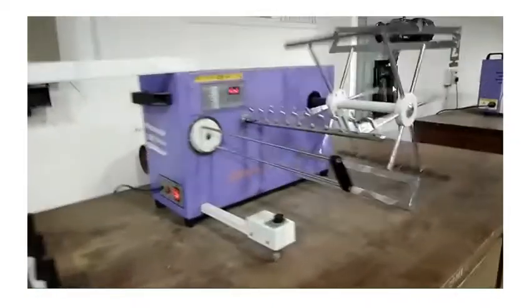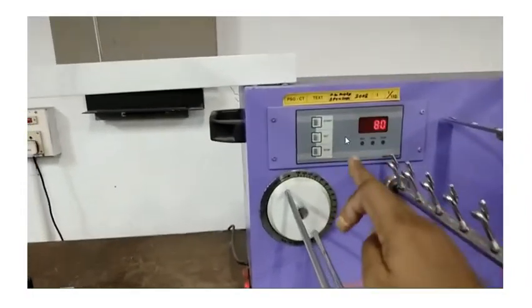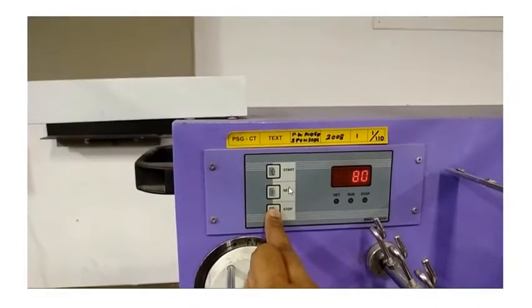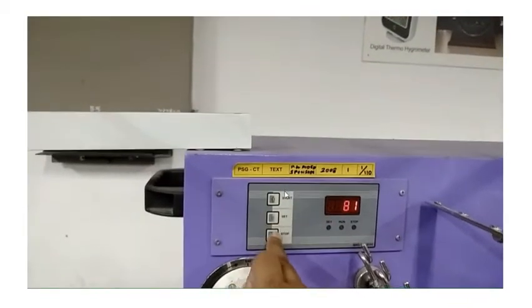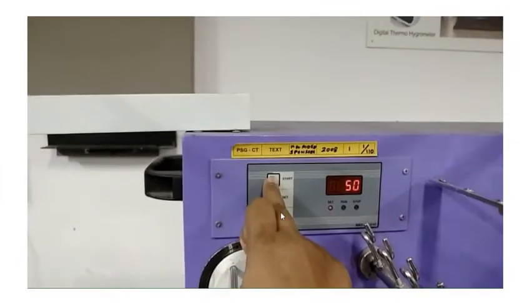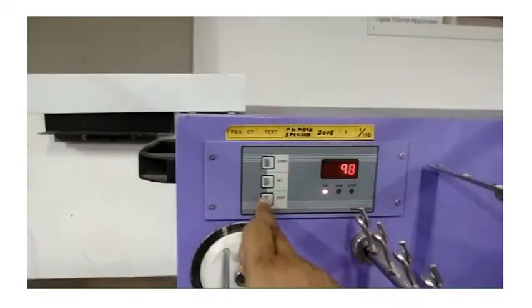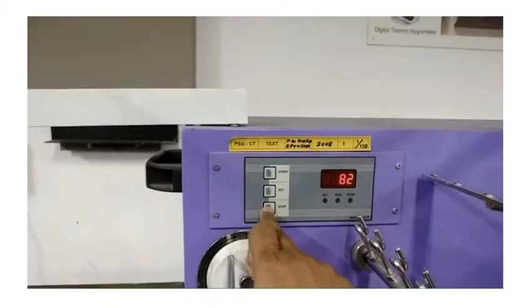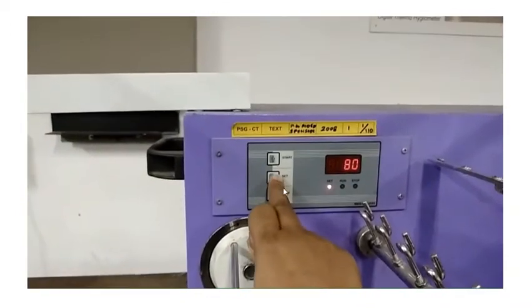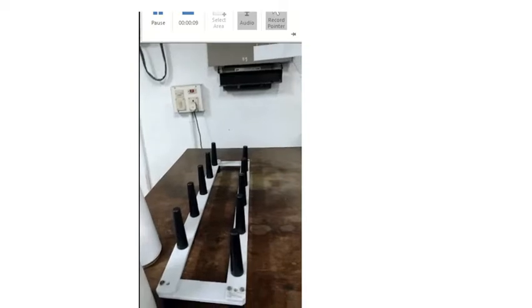Now it automatically starts and rotates. Here is where you set the number of revolutions — press the button 'set'. The number can be increased by pressing the upper arrow and decreased by pressing the down arrow. For 120 yards of lea, you have to set 80 revolutions because the circumference is 1.5 yards. This is the first step in the instrument. This is the guide where the cone can be placed.